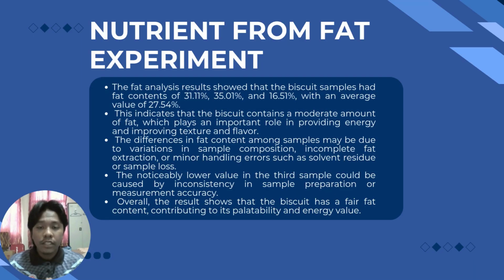The difference in fat content among samples may be due to variations in sample composition, incomplete fat extraction, or minor handling error, such as solvent residue or sample loss. The noticeably lower value in the third sample could be caused by inconsistency in sample preparation or measurement accuracy. Overall, the result shows that the biscuit has a fair fat content, contributing to its palatability and energy value.